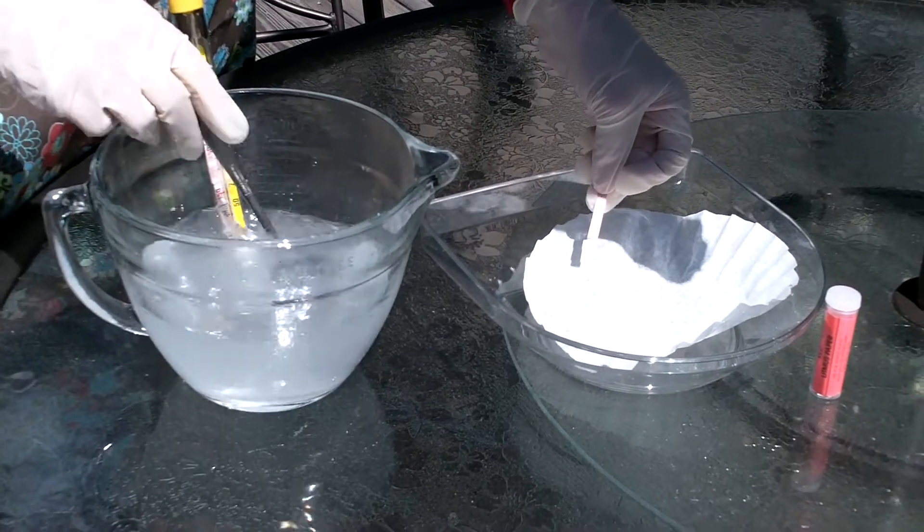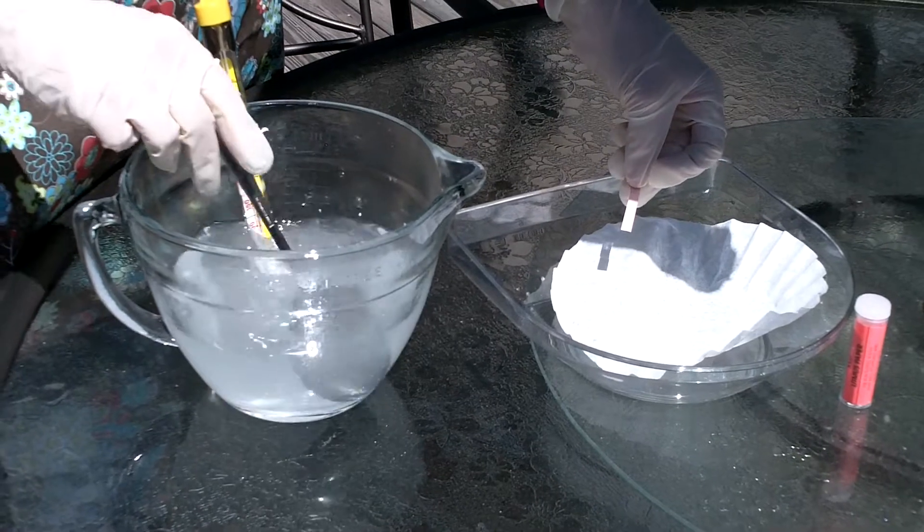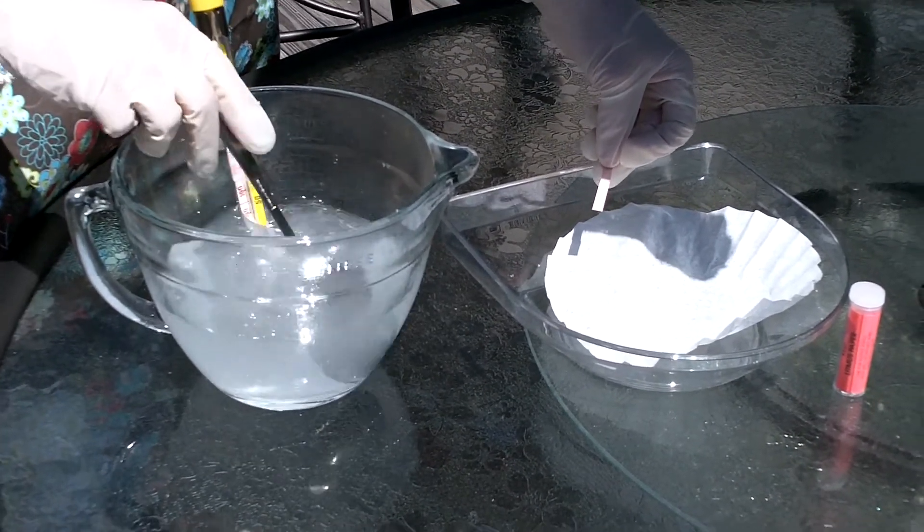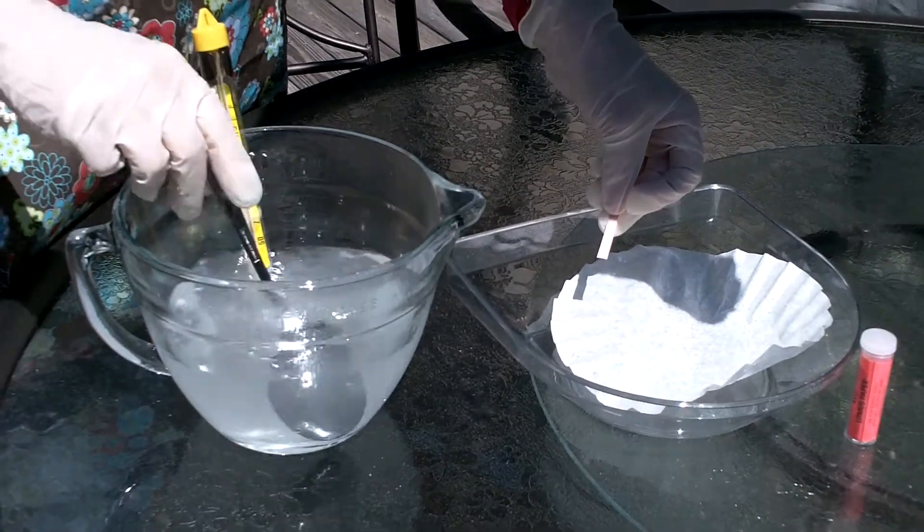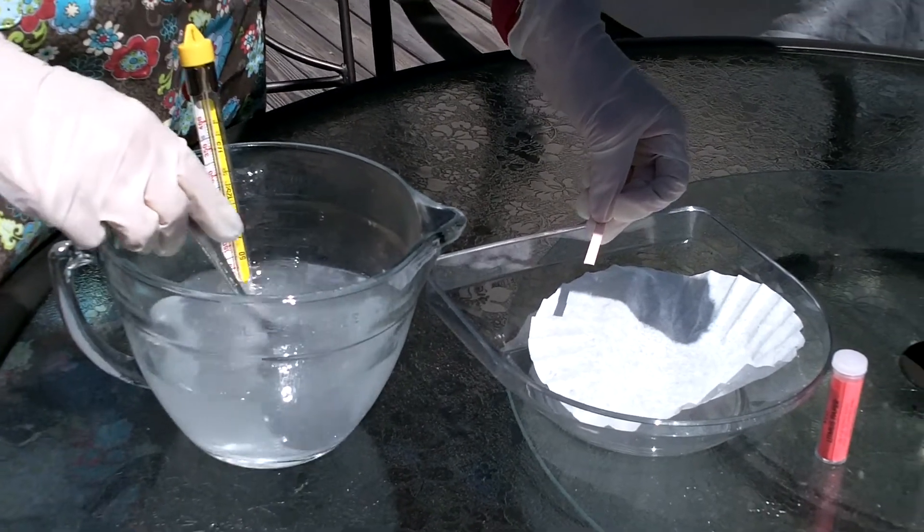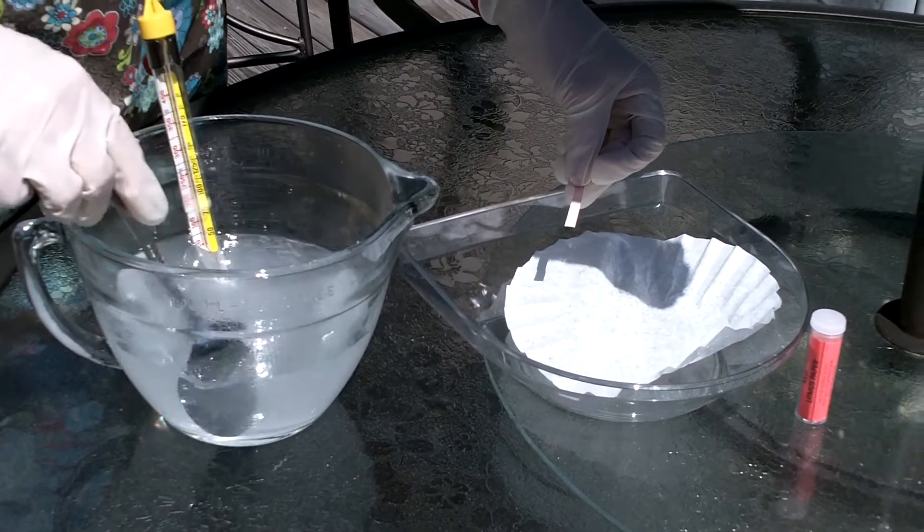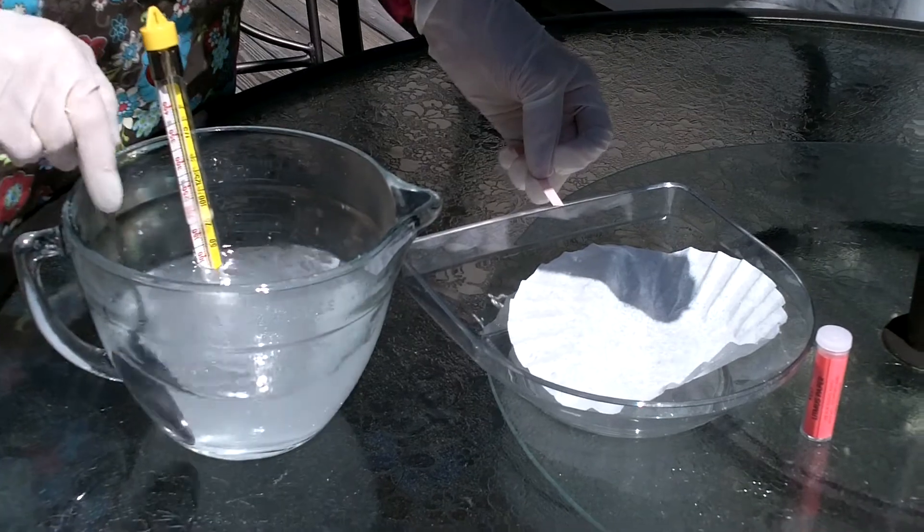As you can see, the solution is starting to become clear and that happens when all of the sodium hydroxide is dissolved. We have a piece of red litmus paper so that we can take a measure of the pH. As we've said, this is sodium hydroxide, so that's a base, and we can prove that by testing it on this pH strip.